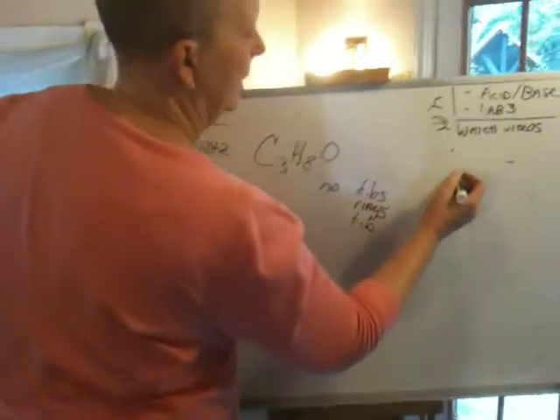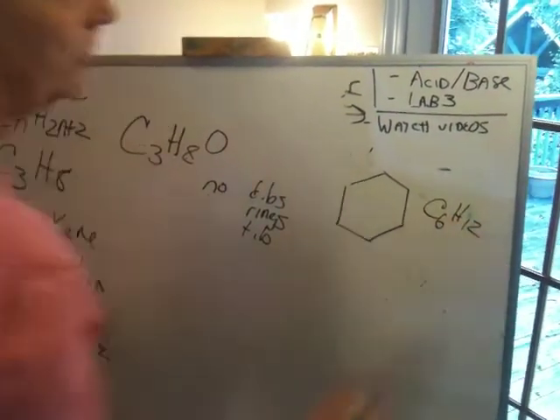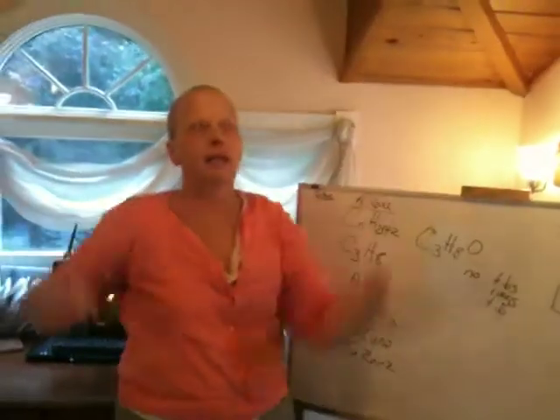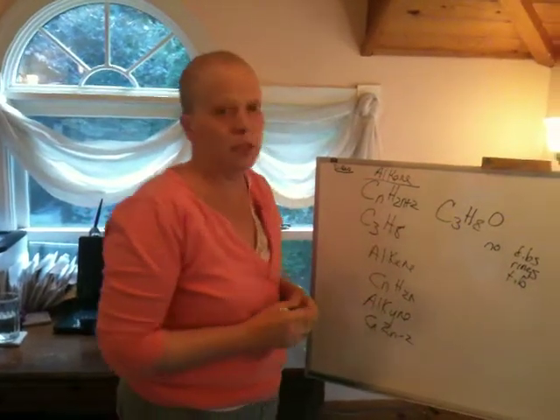Okay, think about a ring, right? If you make a ring like that, that's C6H12, all right? It's missing a pair of hydrogens. So I always tell students to think about their models coming around, biting in on the ends in a ring. You have to spit out 2 hydrogens to do that. Rings cause a loss of hydrogens, okay, in a very systematic way.